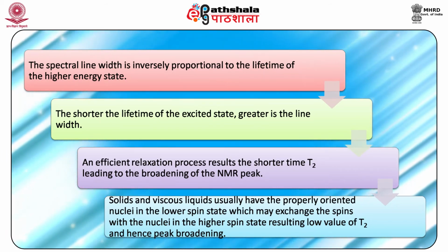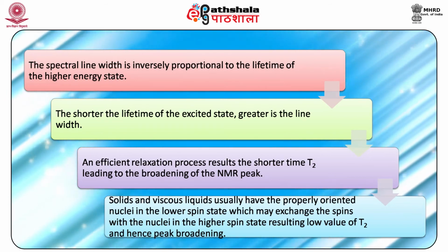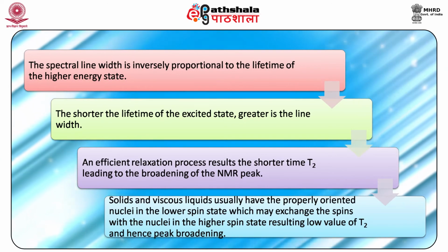Now, the time required for relaxation in the spin-spin relaxation process is known as T2, whereas for spin-lattice relaxation, that is the longitudinal relaxation, the time is T1.